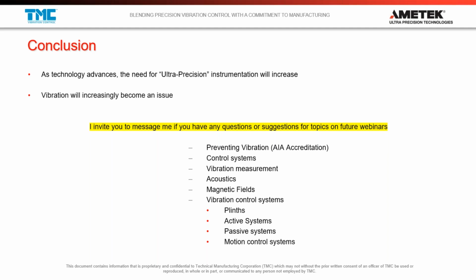If you're using a large isolated pad, that's a hard one to say. If you're using a big concrete block and supporting it with one active system or another, you're not going to be looking at too much of a cost differential, and it depends on the size of the pad. It also depends on what you're trying to achieve from floor vibration isolation. With serial type systems, you might even have the option of eliminating the pad, which could significantly lower the cost of the system.